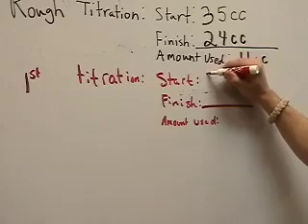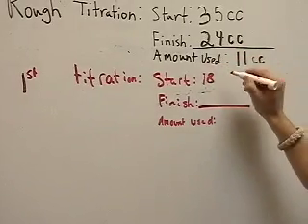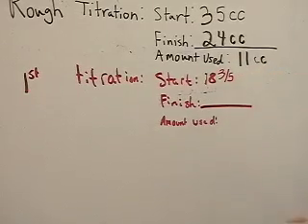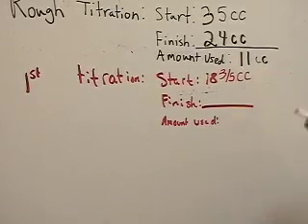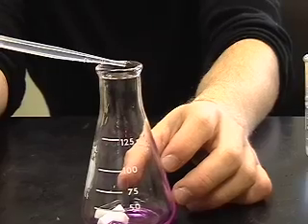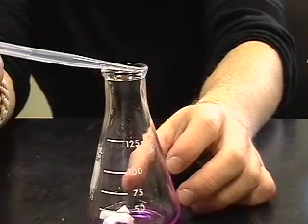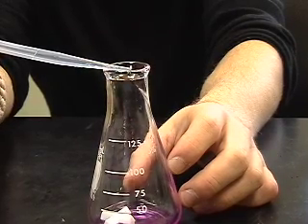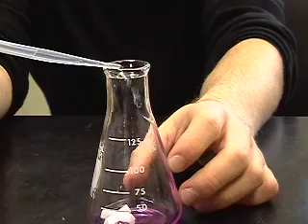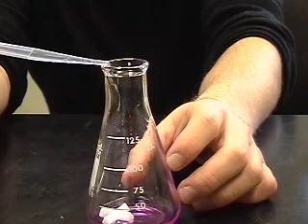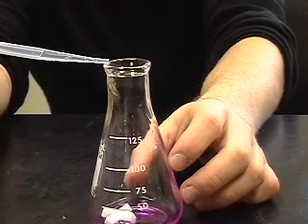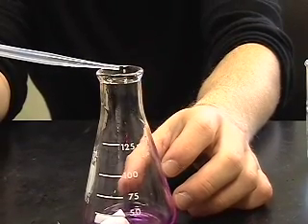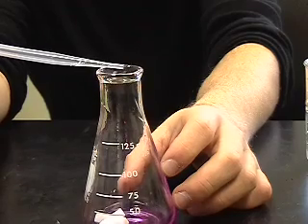Now we're going to do a much more accurate titration, starting with a value of 18 and three-fifths cubic centimeters of acid in the burette. The technique for the next titration will be mostly the same as the first rough one, but there are some major differences. First, we will add water to the base in the flask. When you add water to the flask, the concentration of the sodium hydroxide will change, but the number of moles will not be affected at all because you have not changed the number of grams or molar mass of the NaOH.